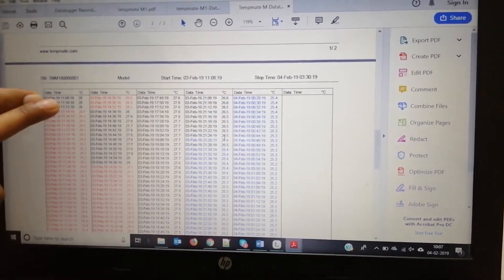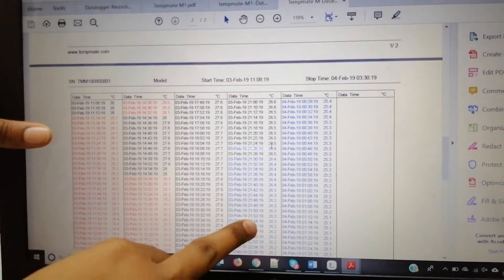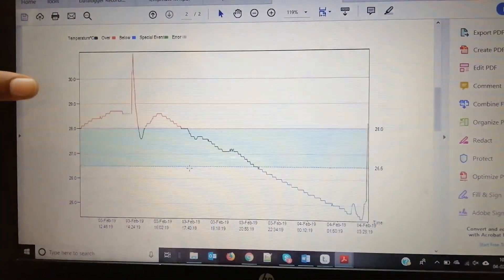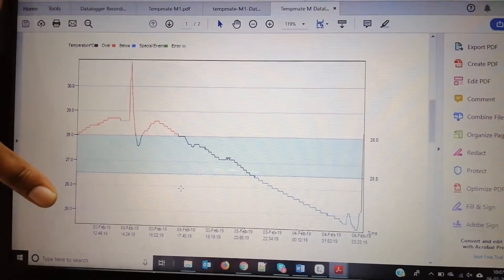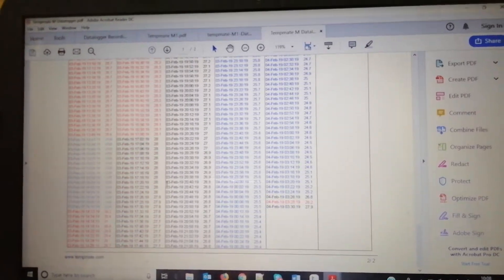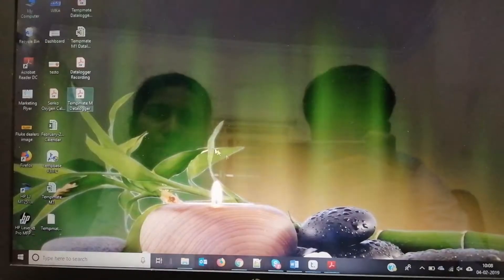You can see the data in both graphical form and tabular form. In the tabular form, if a reading is shown in red it means it is beyond the higher set point; if it is blue it is less than the lower set point. The same is shown in the graphical format — at what particular time what temperature was recorded. You can also export the data in Excel form.